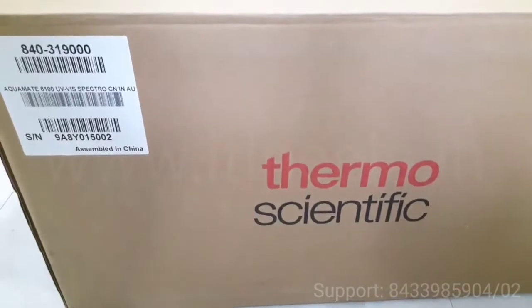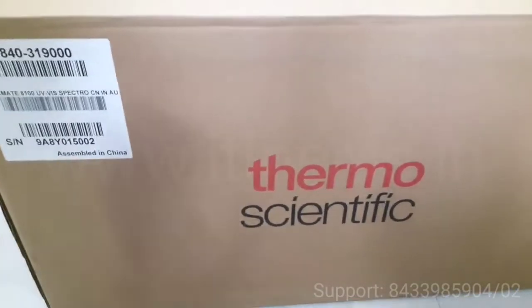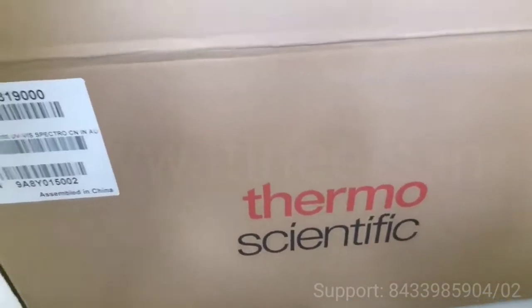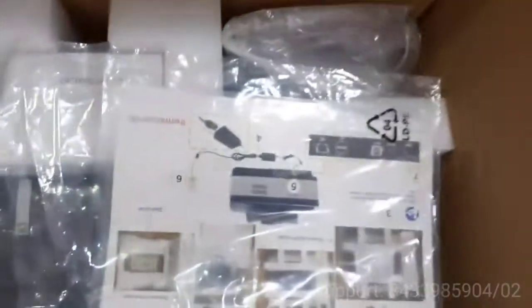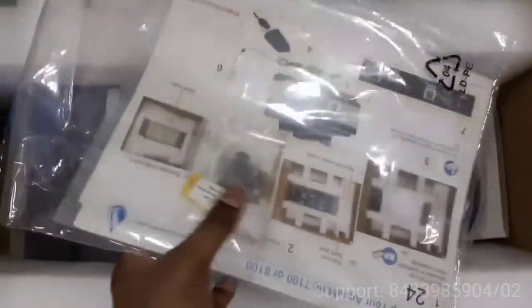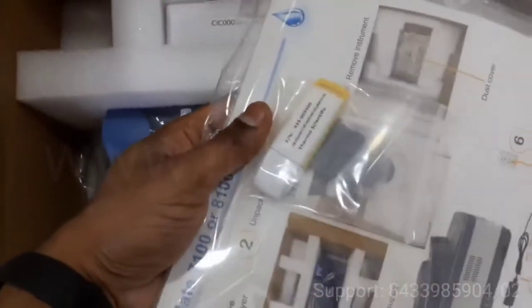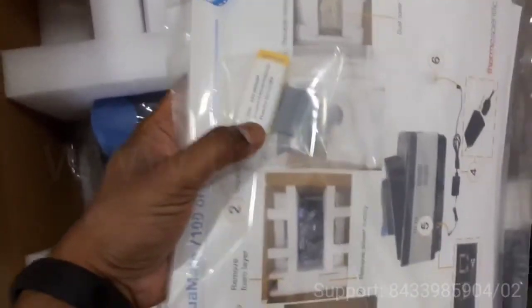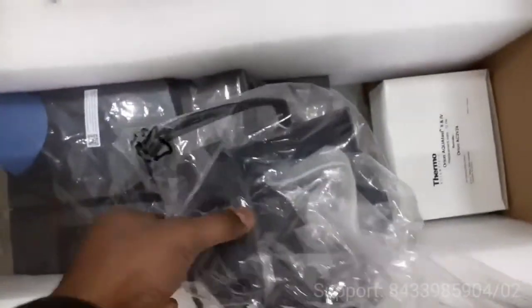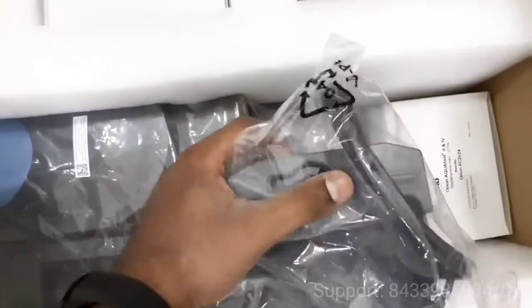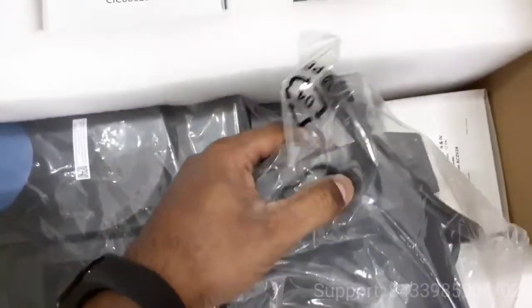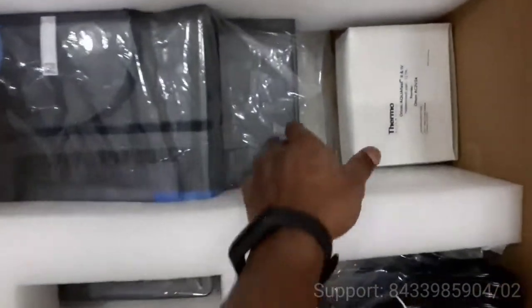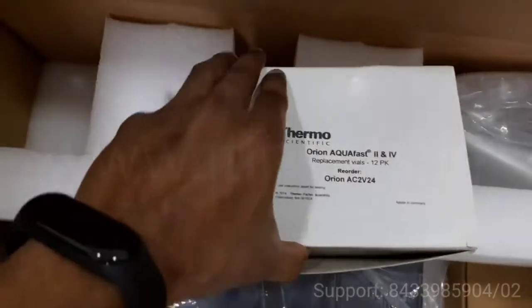This is the AQ 8100 UV plus visible spectrophotometer. It comes with a manual and certificates as well as a USB stick. It has pre-programmed methods. This is an optional cell holder for 2 to 25mm adjustable, and it also has replacement vials.